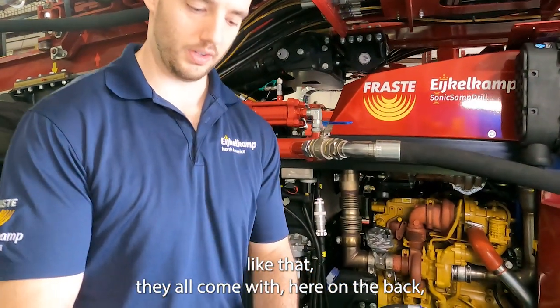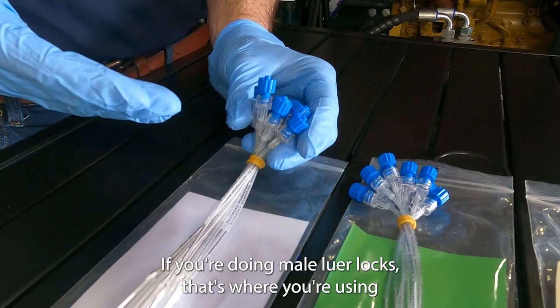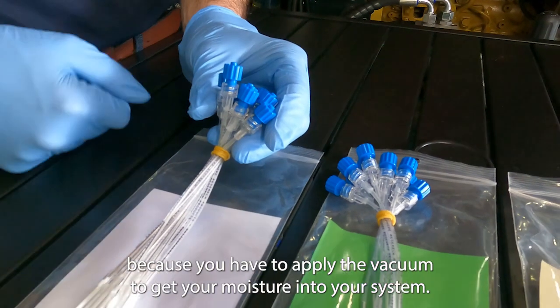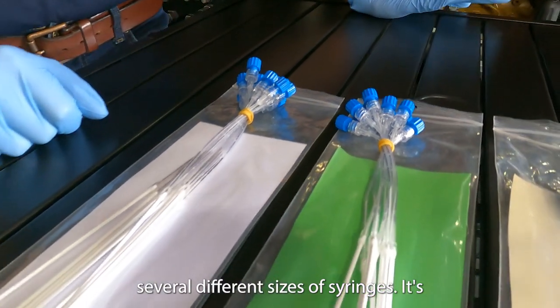They all come with luer locks on the back — either male or female. With male luer locks you use a needle and a vacuum tube because you have to apply a vacuum to get your moisture into the system. With female luer locks they come with several different sizes of syringes. Pretty standard.